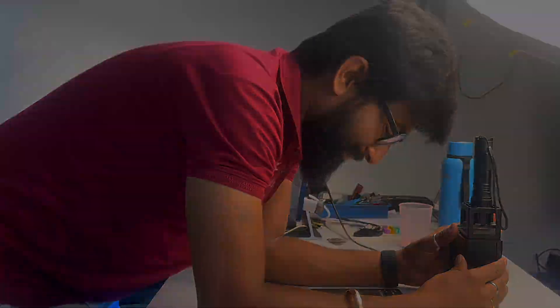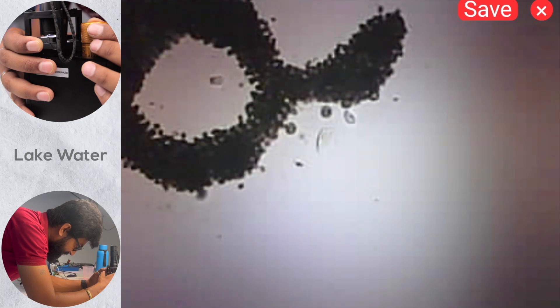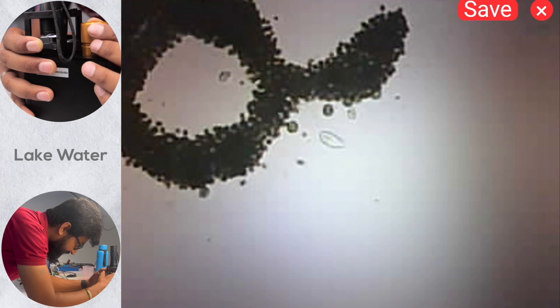Being able to see particles as small as 4 micrometers with such a compact device is insane — I really liked it. So who is this microscope made for? I think it's for curious people who always want to know how things work and what they're made of. It's also a really good device for science professors who want to showcase real microorganisms live in their classes, rather than just showing still images from textbooks or Google. This will definitely help students learn and understand better. Would you consider this $100 microscope to see real-life microorganisms, or would you just Google the images? Share your thoughts in the comments.